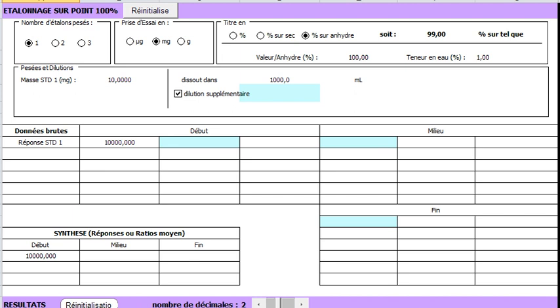Therefore, we provide the form with the water content, which is 1%. The final purity, 99%, is automatically calculated.